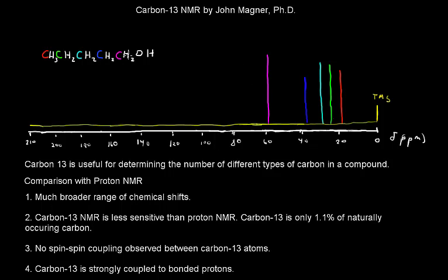And so we are observing carbons here instead of protons, and I've color-coded those, so the carbon that's farthest away from the electronegative oxygen resonates farthest upfield as we would expect. And so chemical shift in carbon-13 depends on the same factors that determine chemical shift in proton NMR, that is, that electronegative substituents de-shield carbons. Remember, electrons shield nuclei from the magnetic field, so anything that pulls electrons away from the observed nuclei will shift their resonances farther downfield.